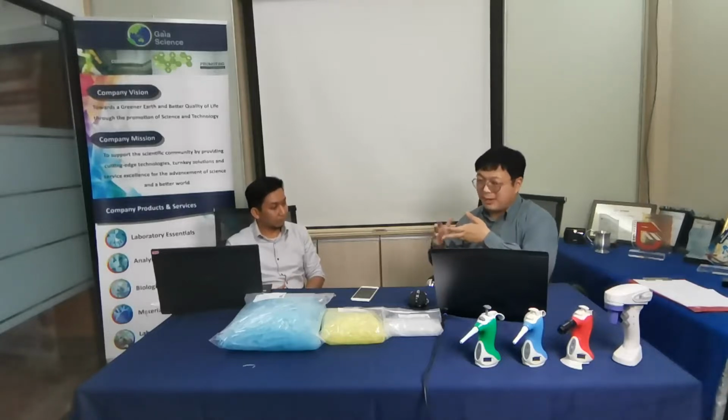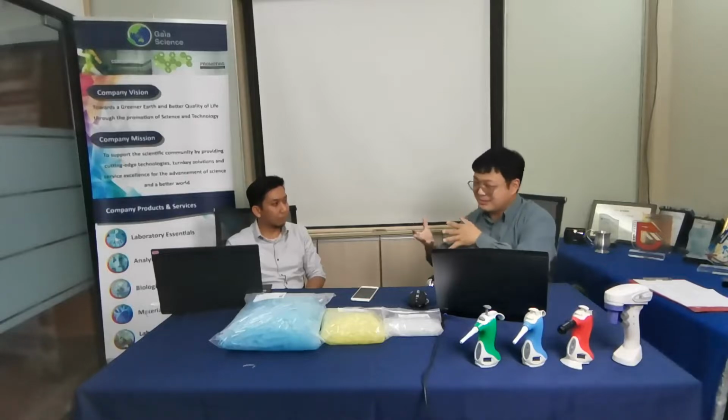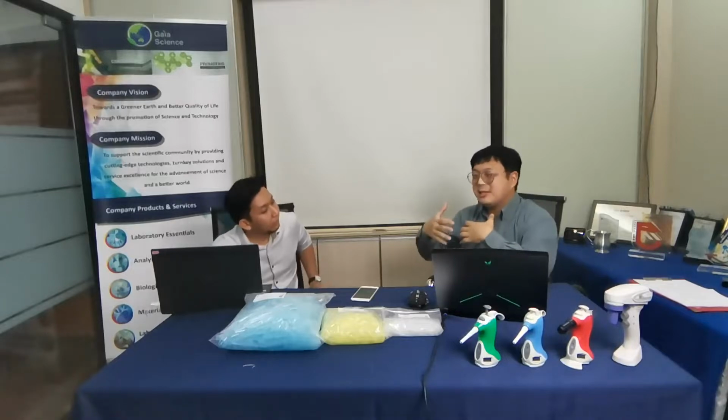And I guess for this purpose, we can say you can get 1 to 200 microliters, right? Yes. So you can see that the configuration for these rack tips is racked, sterile, filtered, short, universal, low retention, and at the size of 200 microliters. So that's one way you can configure your rack tips. Now, I would also add another configuration that you might see as well.